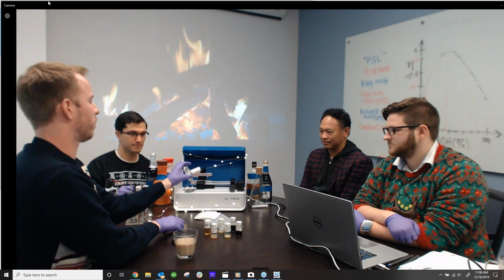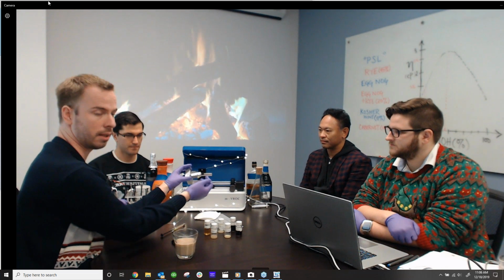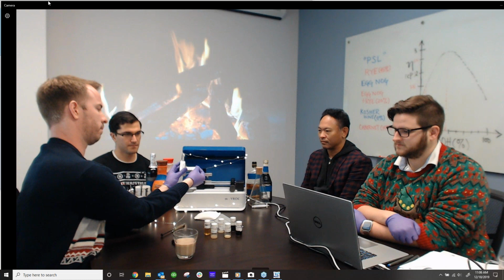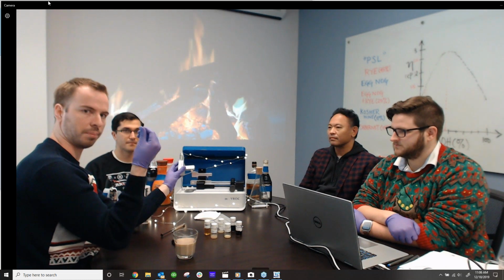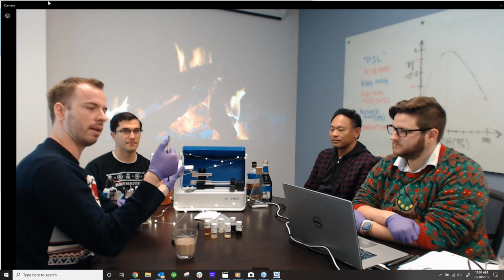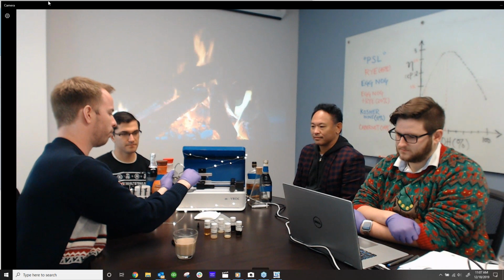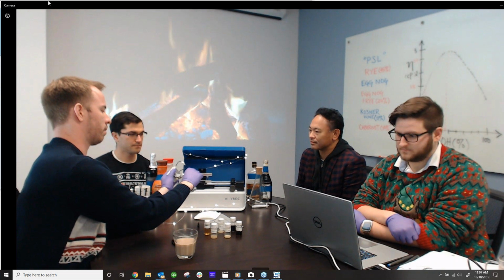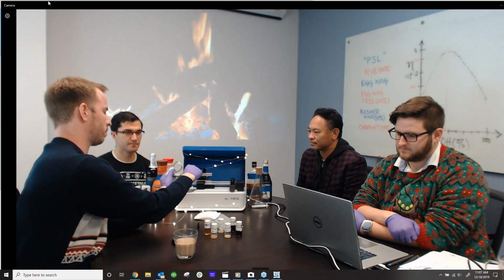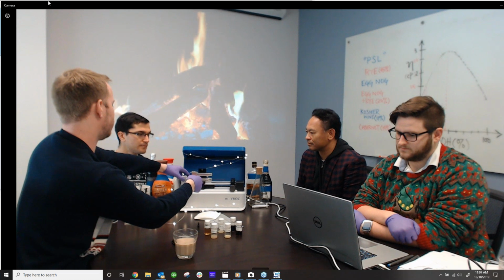The chip right now has this plug in it. This is just to prevent anything from getting into the chip when you're not using it. So we'll go ahead and take this plug out. Okay, I've taken the plug out now. Now take the syringe, and you can see there's threading on the end of the syringe here, and there's threading on the inside of the inlet. I'm going to place the syringe into the chip and thread it in. Okay, now I'm going to place the chip and syringe into this syringe jacket here.